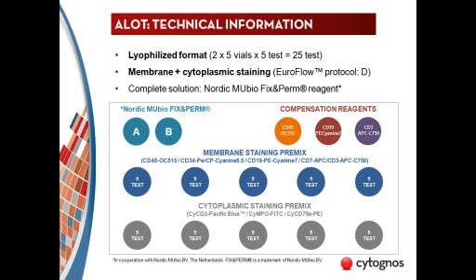So what we are doing is put together all membrane staining antibodies, put together all cytoplasmic staining antibodies, and then split it. So we also have 25 tests, and we split in 5 different tests, but we have 5 different tests for membrane and cytoplasmic, and so on.